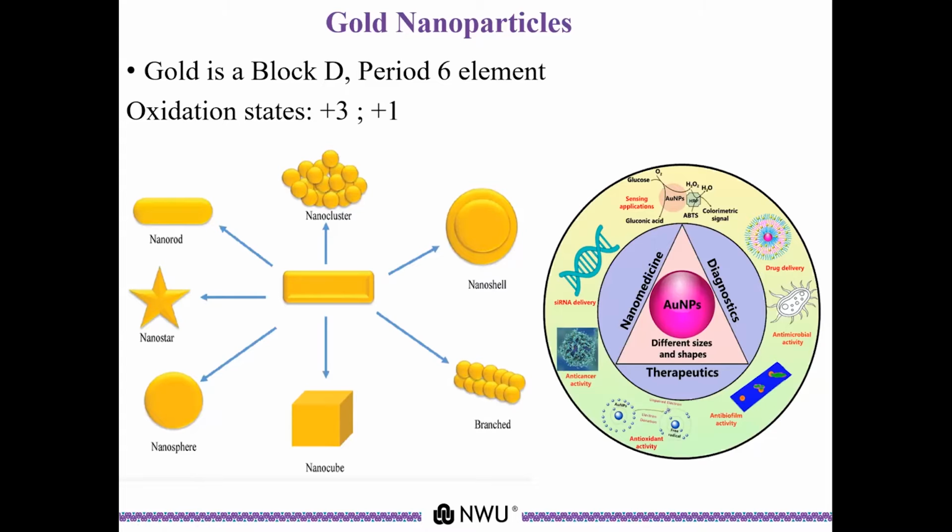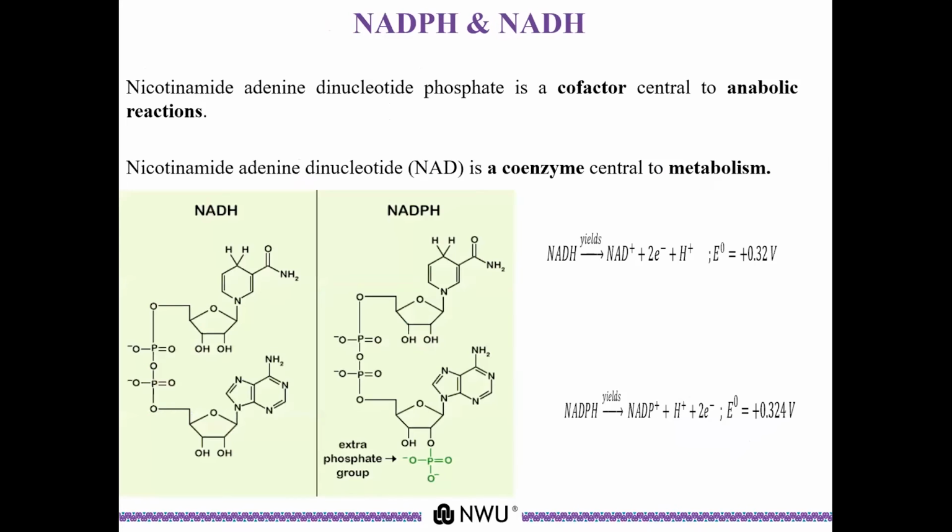Okay, so I'm going to just reiterate what I just said, maybe for the sake of progress. Basically, I'm dealing with gold nanoparticles. Specifically, gold nanoparticles are used in nanomedicine, nanodiagnostics, and nanotherapeutics. And I'll be dealing with gold nanostars.